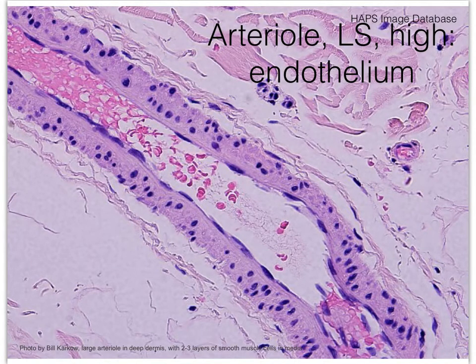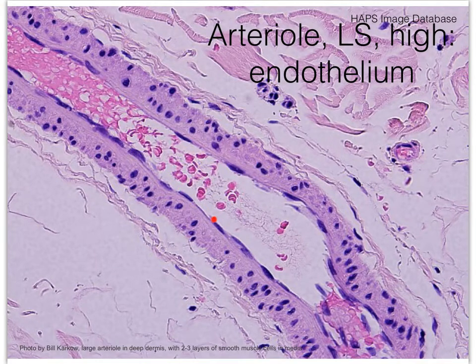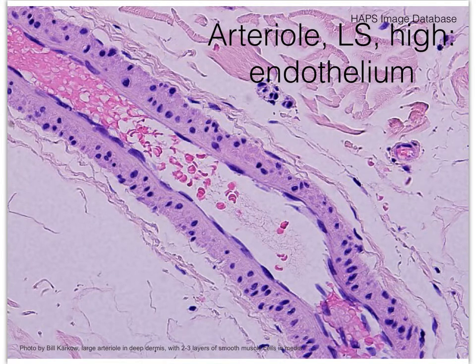Red blood cells, when they're mature, lack organelles and a nucleus, so they just look like nice pink reddish little blobs. We can recognize this as simple squamous epithelium because when we focus on the nuclei, notice how flat they are. That's what you'll often have to do to identify epithelial tissues — look at the shape of the nuclei. So the tissue that lines all blood vessels is simple squamous epithelial tissue.